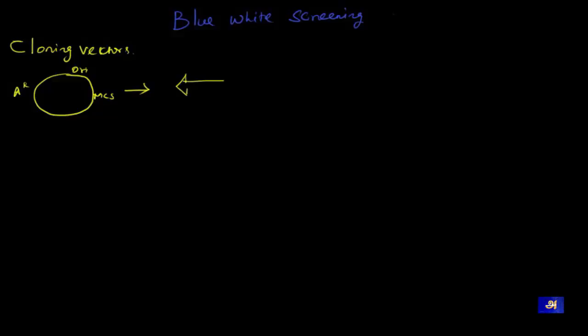We all know the plasmid vector is a circular DNA which consists of three important regions: origin of replication, antibiotic resistance genes, and multiple cloning sites. Origin of replication, as the name suggests, is where the replication starts. The antibiotic resistance sequences consist of different antibiotics; here we will look at ampicillin resistance. And multiple cloning sites are the sites where endonucleases bind, and they are unique sites because this site exists nowhere else in the plasmid vector.